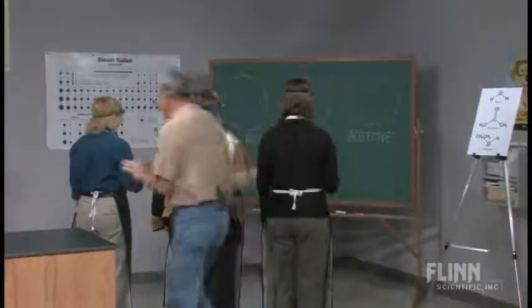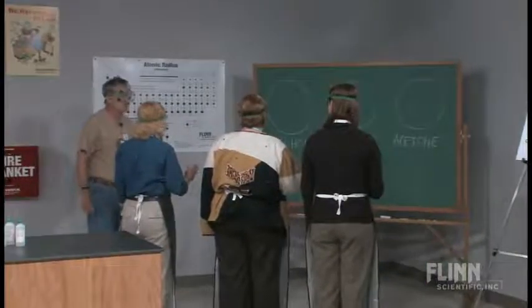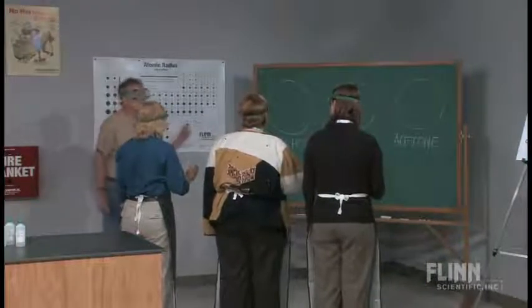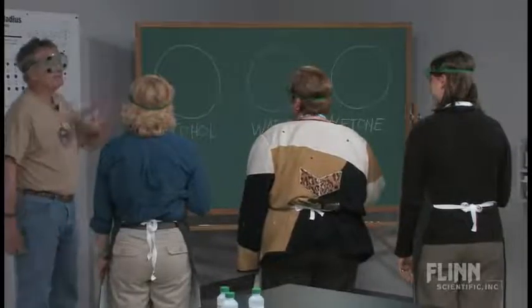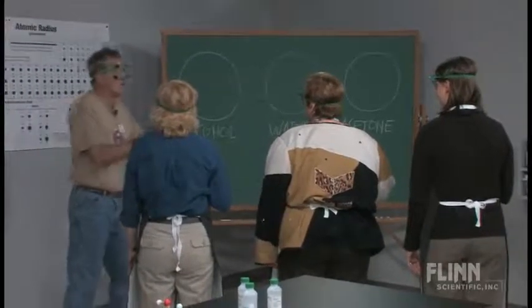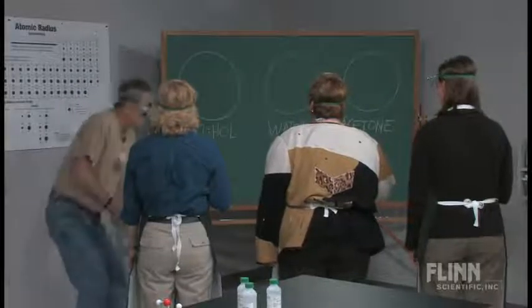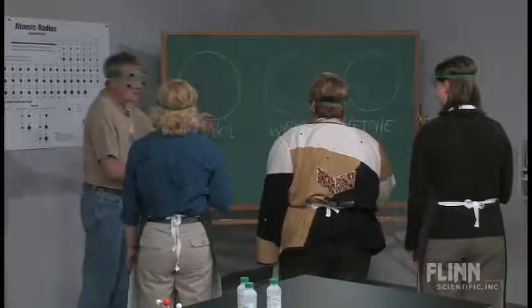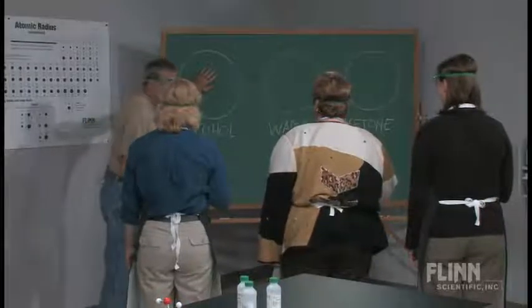Now, in a moment, I'm going to ask you to simultaneously, all at the same time even, throw your liquid at the circle. And as you all are completely aware, I'm sure that's throw the liquid, not the beaker. So you will, at some point, hold on to the beaker and let the liquid fly towards it. We're trying to hit the center of the circle.